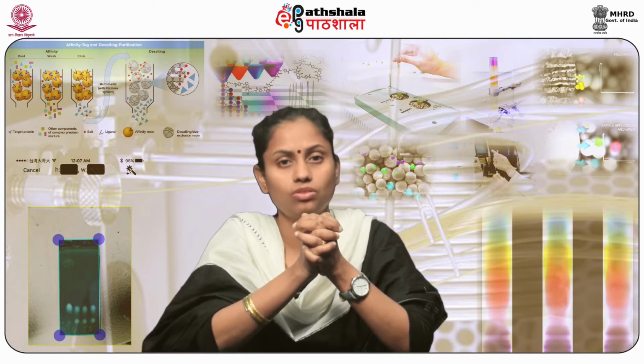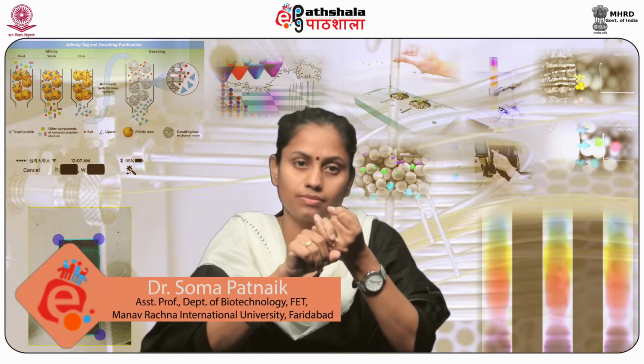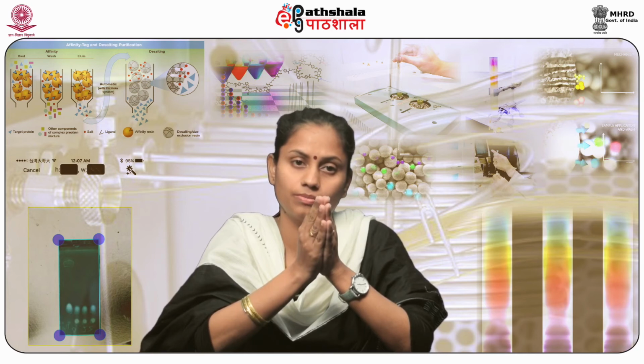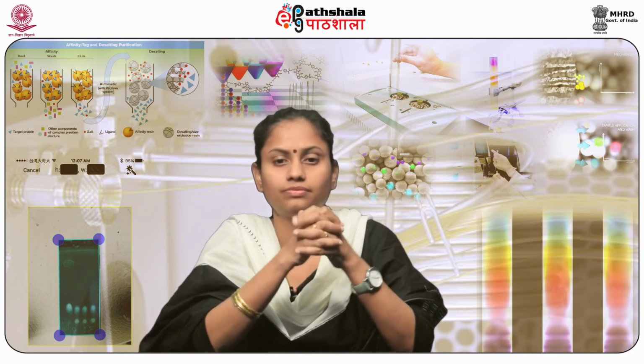The performance of ion exchange chromatography depends on factors as discussed, such as pH, and additives present in the buffer, which can be either salts such as NaCl, detergents, and zwitterions. The presence of organic solvents also affects the elution of compounds. In the end, temperature also plays an important role in elution as it affects the pH of the buffer. Thank you.